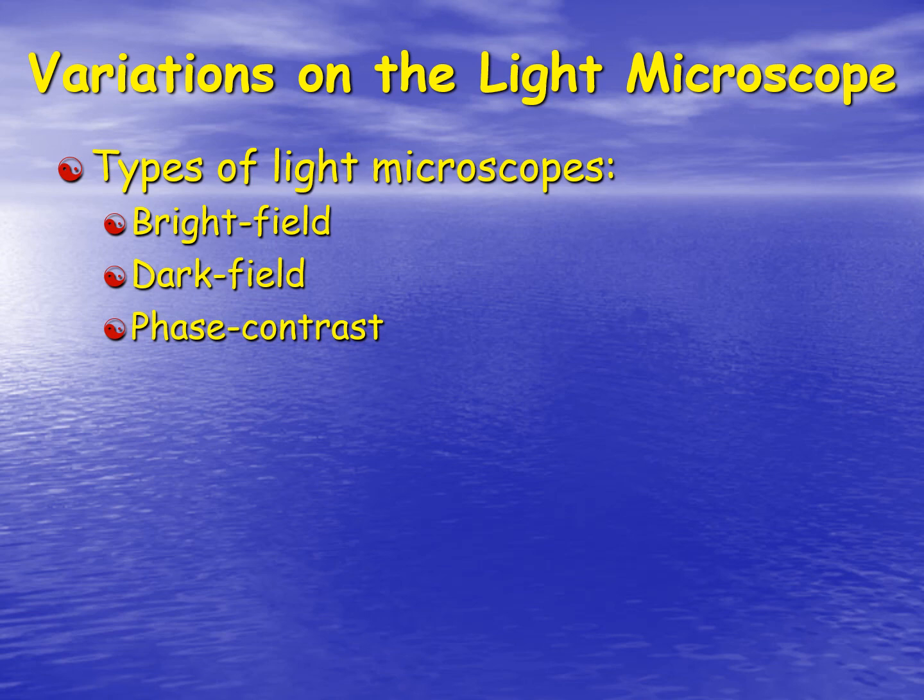Phase contrast microscopes, most of you will never see one of these, but what we use is we try to get a lot of those wavelengths of the different light spectrum that's coming through hitting at the same time. They're peaking and troughing at the same time. And what this will do is actually give you good contrast, especially on the surface of your subject.